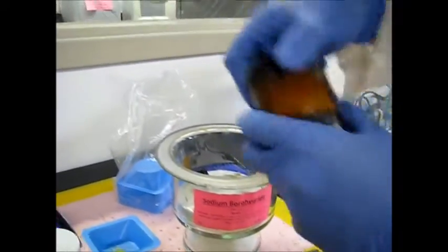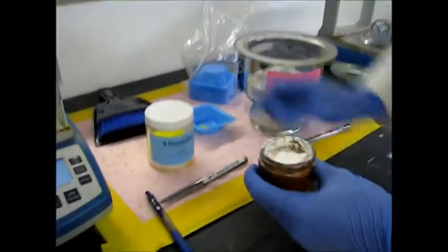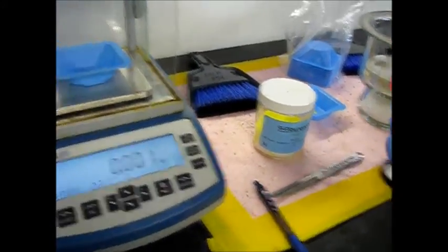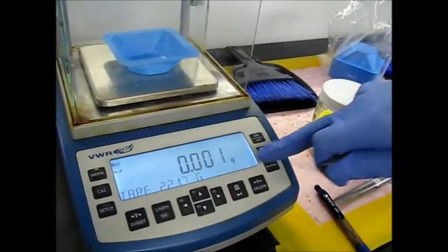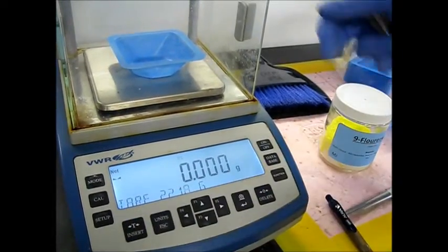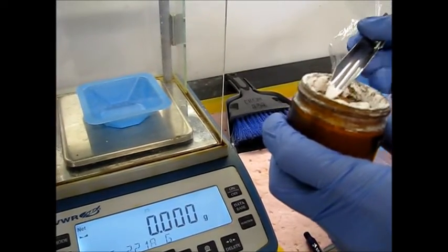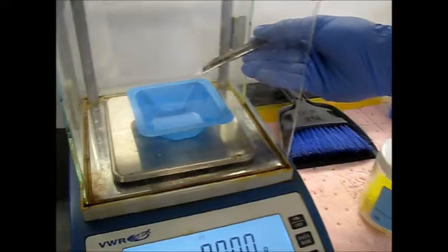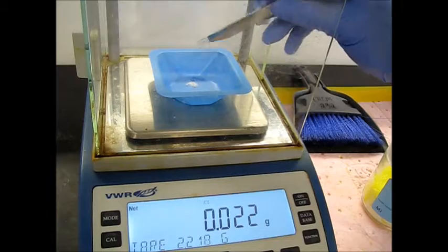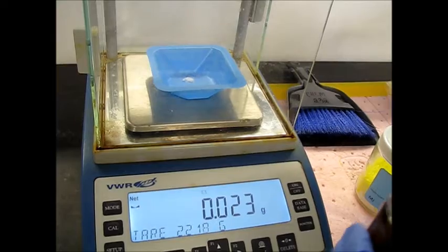So now we're going to grab our sodium borohydride and get 50 milligrams, 0.05 grams. We did have a little bit of fluctuation, so we're just going to re-tare. Cool. It shouldn't be much at all. Just going to grab a little bit, tap it out. Notice it is hygroscopic, which means it'll be very sticky, so you're just going to have to dump it. So we got about half of what we need.